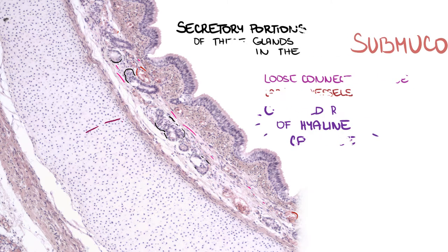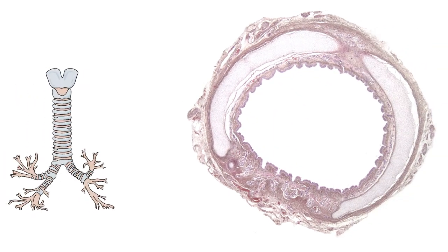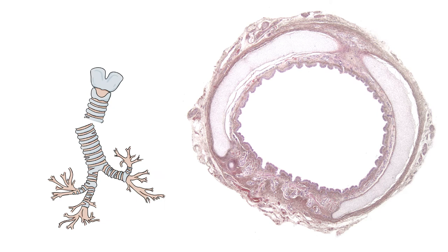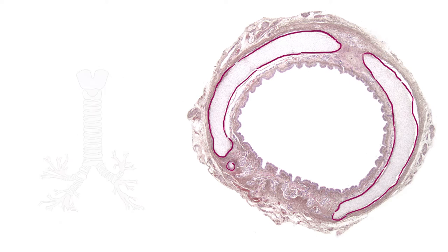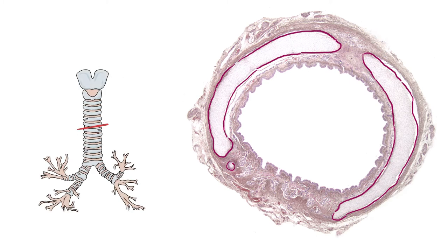This is not a precise cross-section, because we see hyaline cartilage as if it were cut in pieces, instead of a nice C-shaped structure. It's given by the plane of the section, as we can see cartilages from different levels with submucosal loose connective tissue in between.